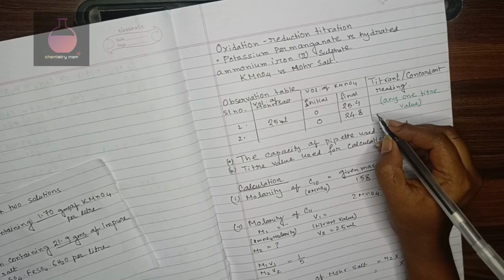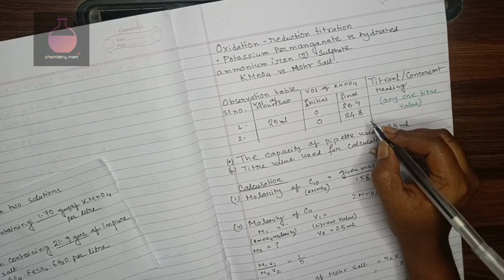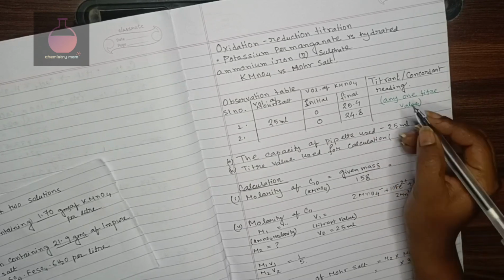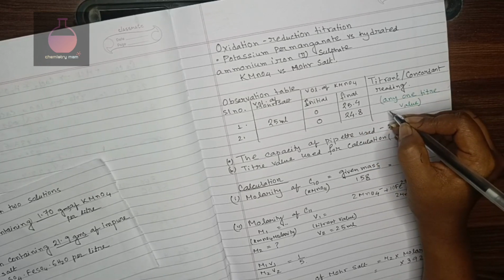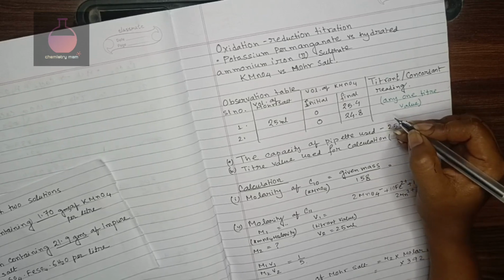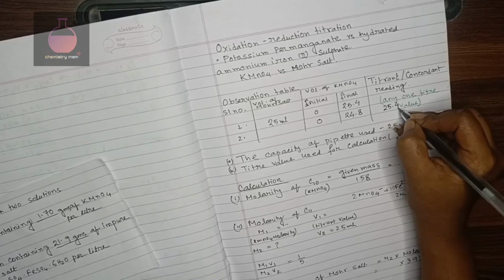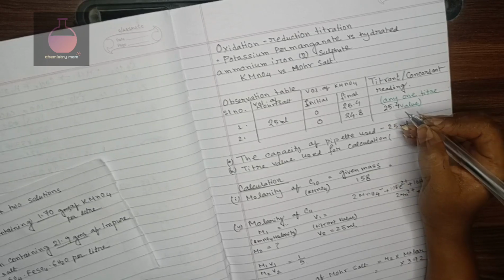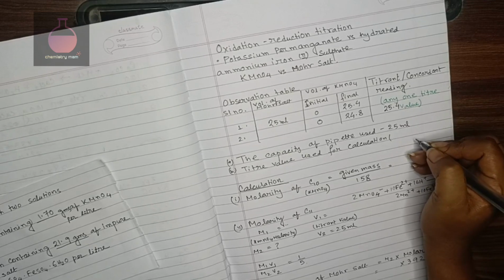Though if your value is 25 that is very good, still up to this range can differ. Then any of the values you can take for your calculation. Suppose in this case I am going to take 25.4 as my value.